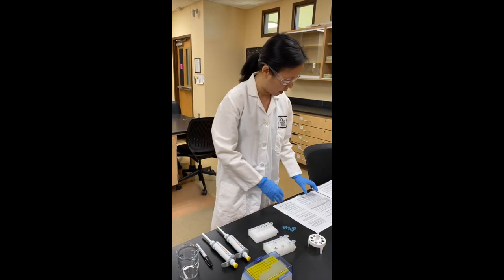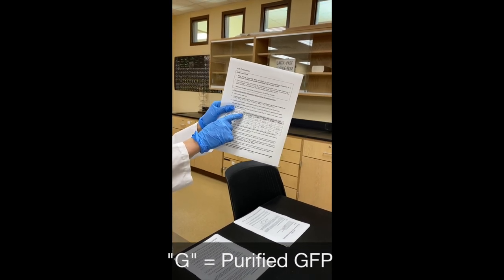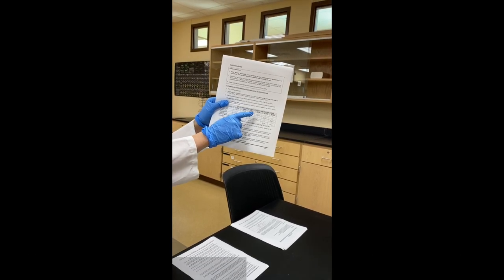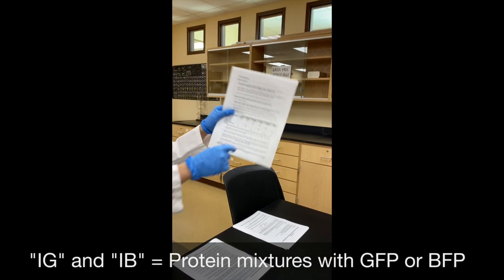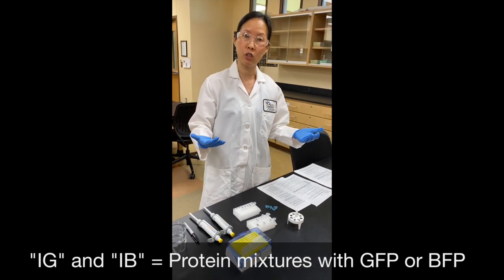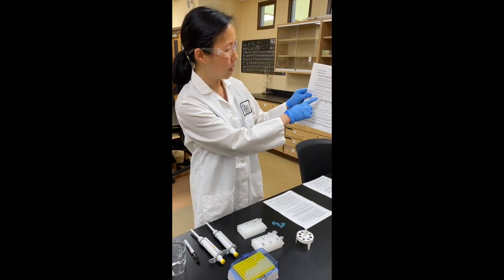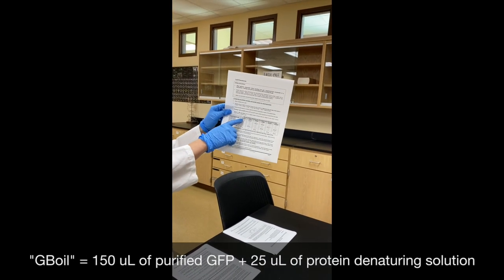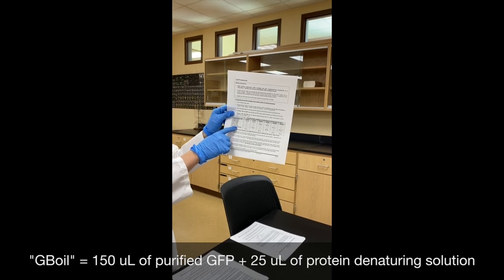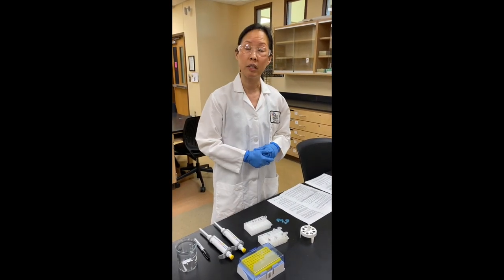Let's put these six samples together. They are called G-boil, G-nat (nat stands for native, meaning you won't heat-denature those proteins), B-boil, B-nat, IG-boil, and IB-boil. The letter I stands for impure, meaning those contain the protein mixtures, not the purified GFP and BFP. To make G-boil, I put 150 microliters of purified GFP and 25 microliters of protein denaturing solution into a microfuge tube. Change your tips every single time you pipette something to avoid cross-contaminating the samples.